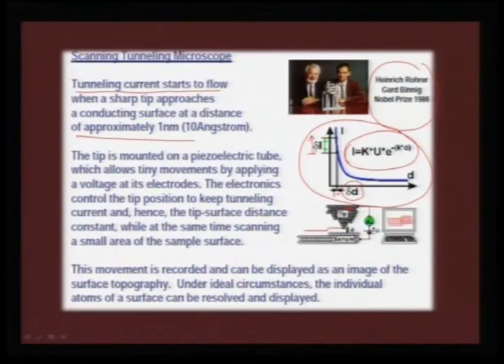You cannot have a non-metal or an insulating compound, and therefore if you have an insulating compound or a biological sample, then you need to come up with another probe which will help you to do the same atomic level mapping, and incidentally that is what AFM is able to do. Atomic force microscope is mainly meant for non-conducting surfaces. So we will go more into this detail as we progress through this lecture.